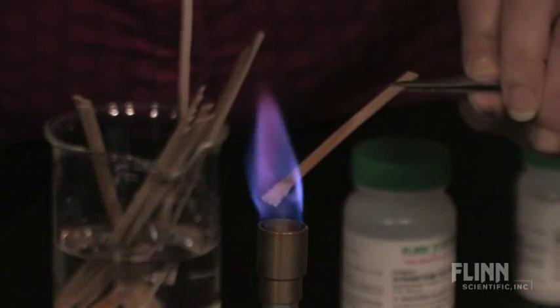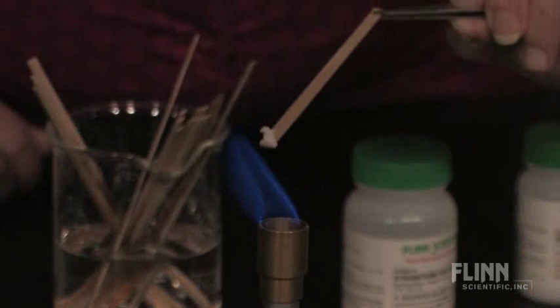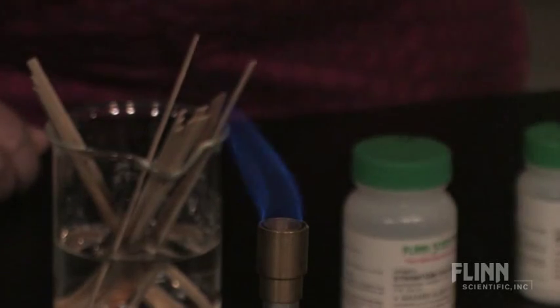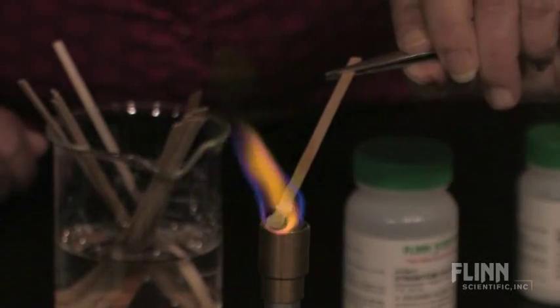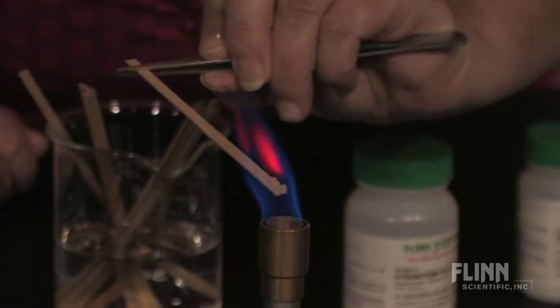Copper, potassium, lithium, sodium, and strontium.